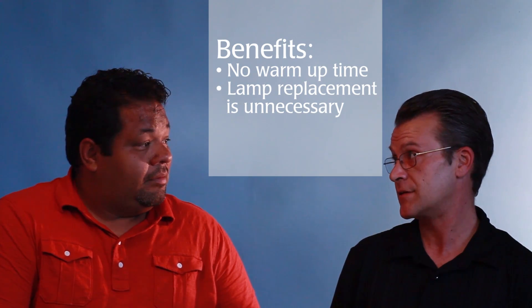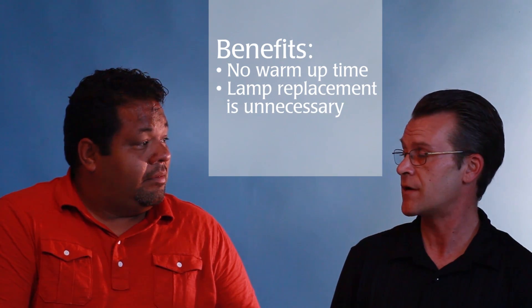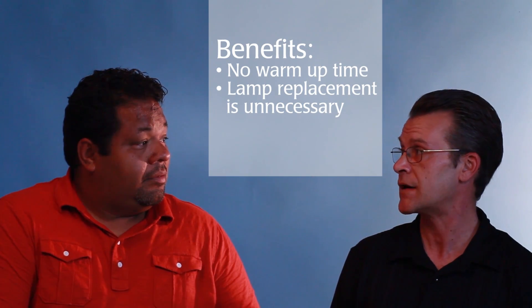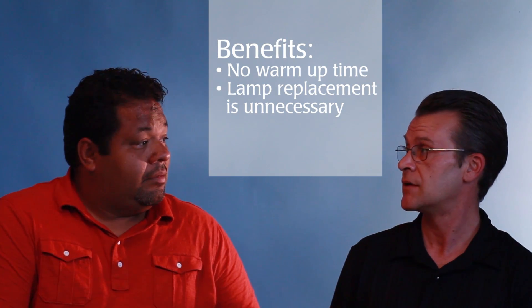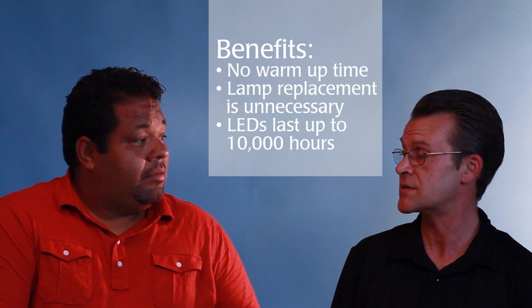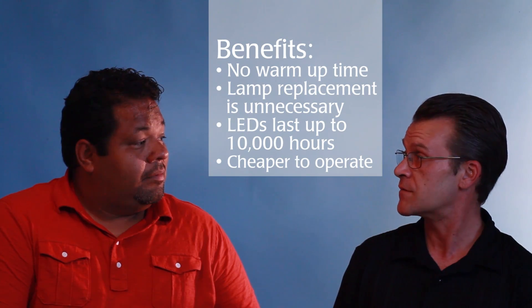As a second benefit, you do not have to replace the lamps. If you use either a mercury vapor or a halogen lamp, you have to replace the lamps anywhere between every 1,000 and 2,000 hours. These LEDs actually have a lifetime of over 10,000 hours, which means in the long run, you're going to save a lot of money on the maintenance of the instrument over time.